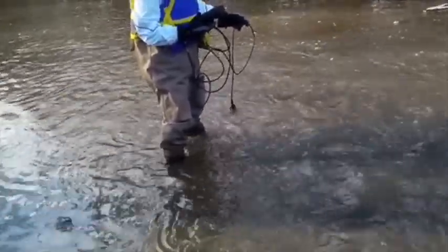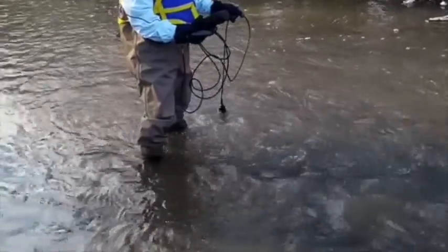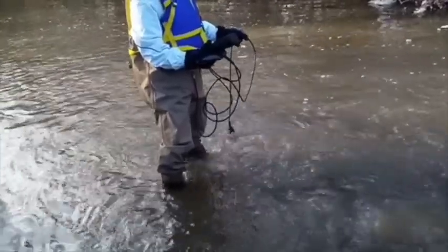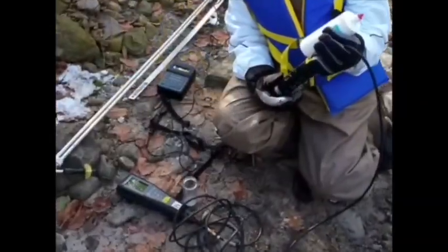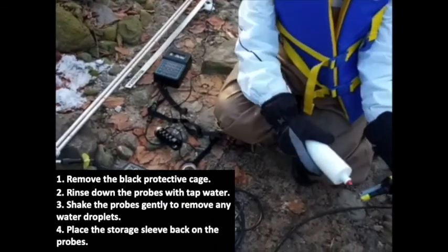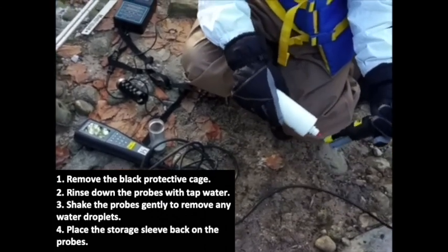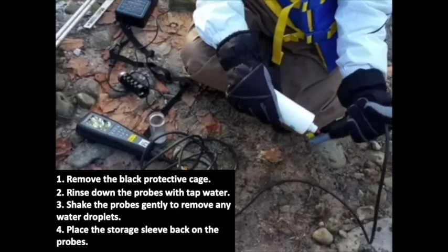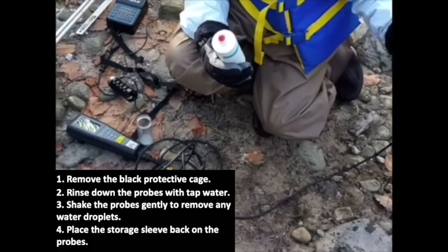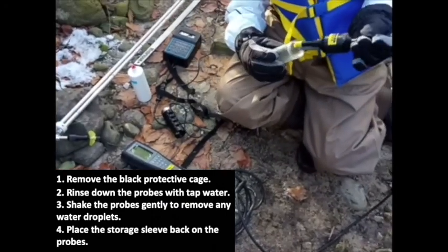Looking at your multimeter, you will see that the numbers jump around; that will stabilize after a few minutes, and you will see an AS beside your value. After you have finished measuring, remove the black protective cage, spray down your probes with plain tap water — not distilled water — and ensure you do this after each use. Shake your probes so any residual water droplets are removed, then use your plastic probe protective sleeve.